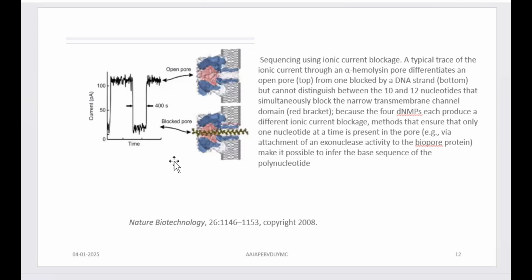When you talk about solid state nanopores, they are silicon based nanopores, which have atomic sized membranes. So in place of the alpha hemolysin protein immersed into a lipid bilayer, you have solid state nanopore systems based on silicon. They are also available. Why? What is the importance of these? The importance is against that of biological ones like protein based nanopores.